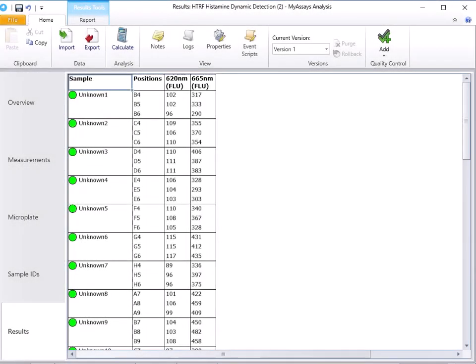In this video, I'll demonstrate how to configure custom analysis for the HTRF Histamine Dynamic Detection Kit. I have opened the new protocol we created in the previous video in this series, with our measurement data already imported. If you've not yet viewed that video, please do so now from the below link.